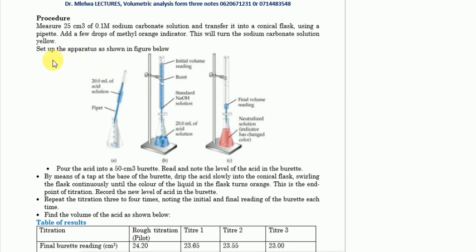After that, set up the apparatus as shown in this figure. So put the burette there, then add the solution. Actually, this arrangement, I can't say this is the true arrangement, because normally what is put in the burette is an acid, it is not a base.